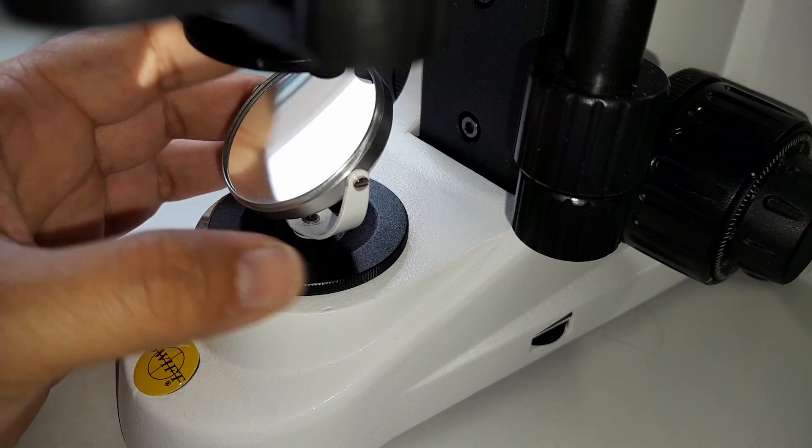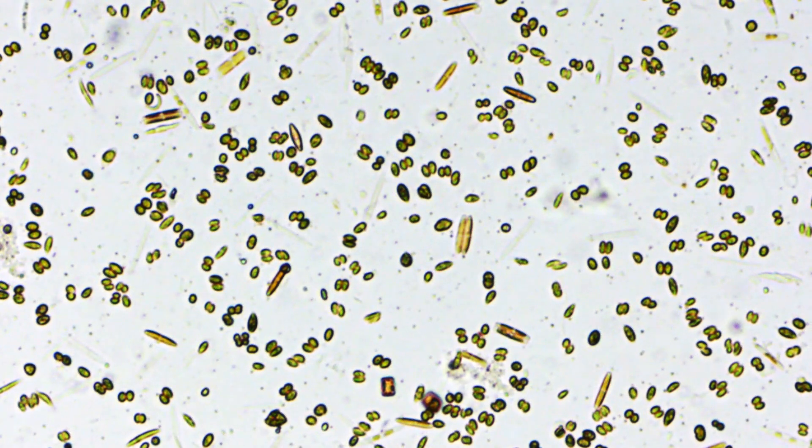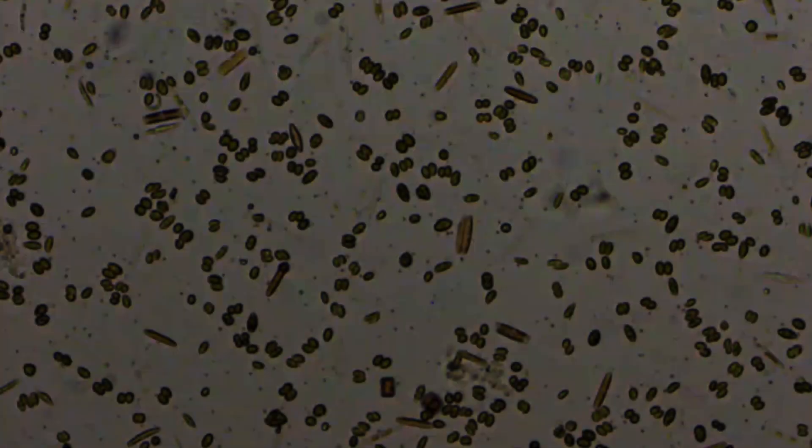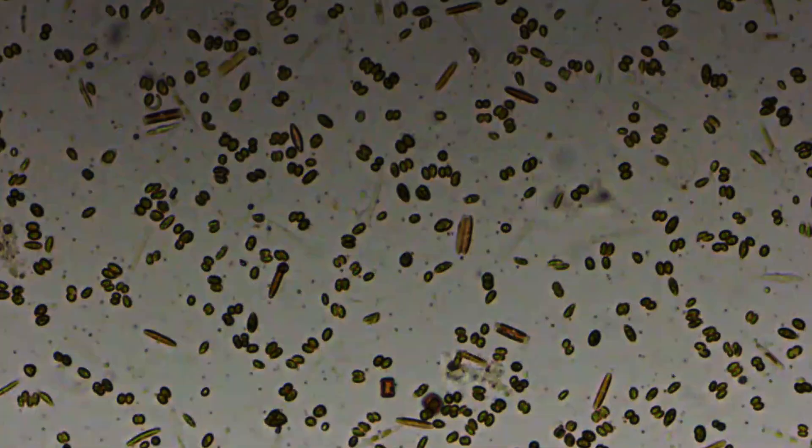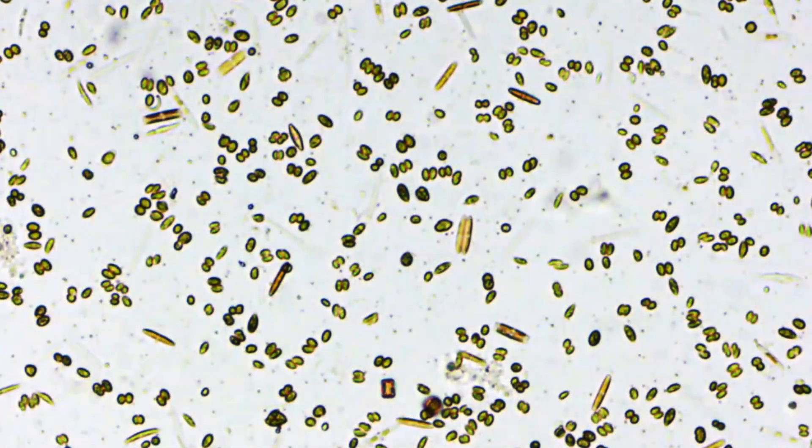Now I put also an algae specimen under the microscope to illustrate how twisting and turning the mirror, how this affects the light intensity. Here I'm using a flashlight as a light source.